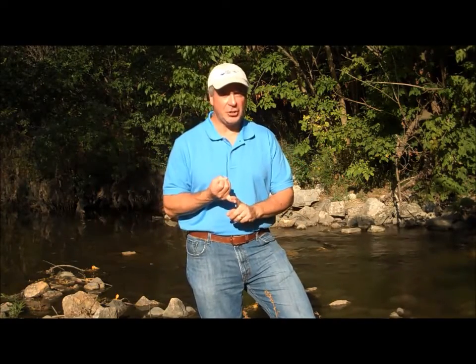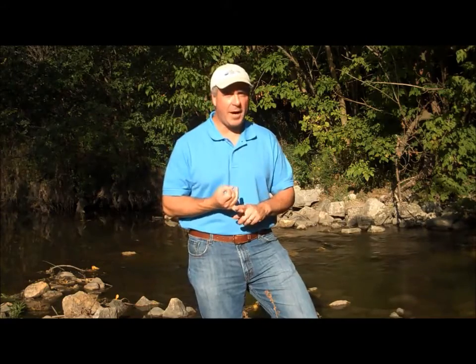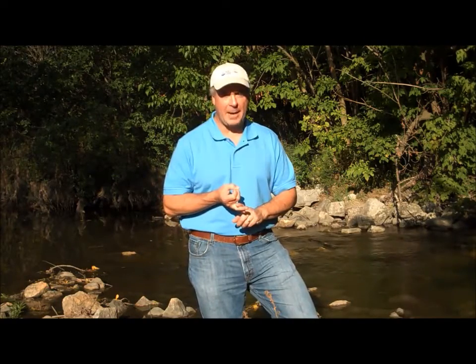So dress appropriately, especially with closed-toed shoes. The footing down here, there's a lot of rocks. It's very unstable at times, so you want to have good footwear on. The other thing we do is we wear splash goggles when we're working with the water or when we're collecting our water samples.